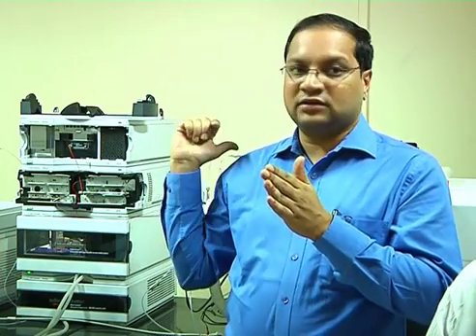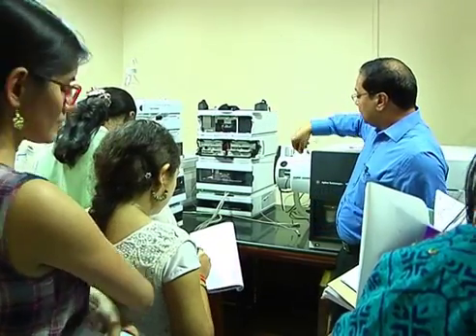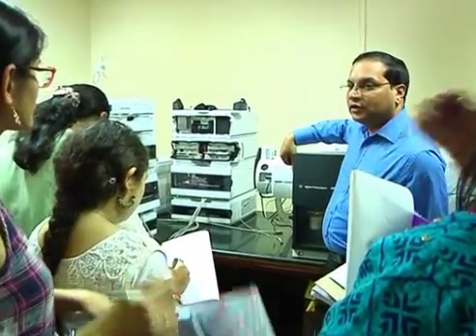What is that? The third dimension given to that analysis is the mass spec, which gives the mass to charge, or mass. When one peak of the HPLC goes into the mass spec, it sees beyond those 2 dimensions, which is mass, and it will tell you that one peak is not one compound; there are 100 more masses within that peak.